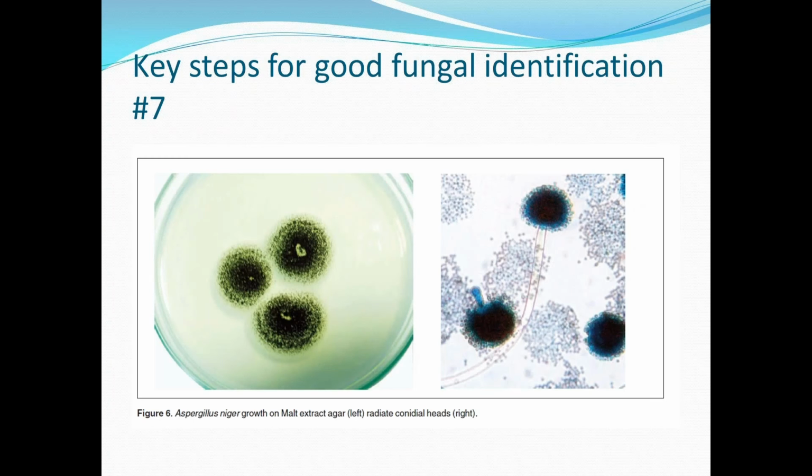So the first, we have Aspergillus niger, one of the most common species of Aspergillus. Although it's characterized by melanized colonies, it can be tricky to identify at first because the black pigmentation takes some time to form. So you get the idea for each fungus presented. There's an image of growth on agar, accompanied by a microscopic image, accompanied by some more detailed notes.